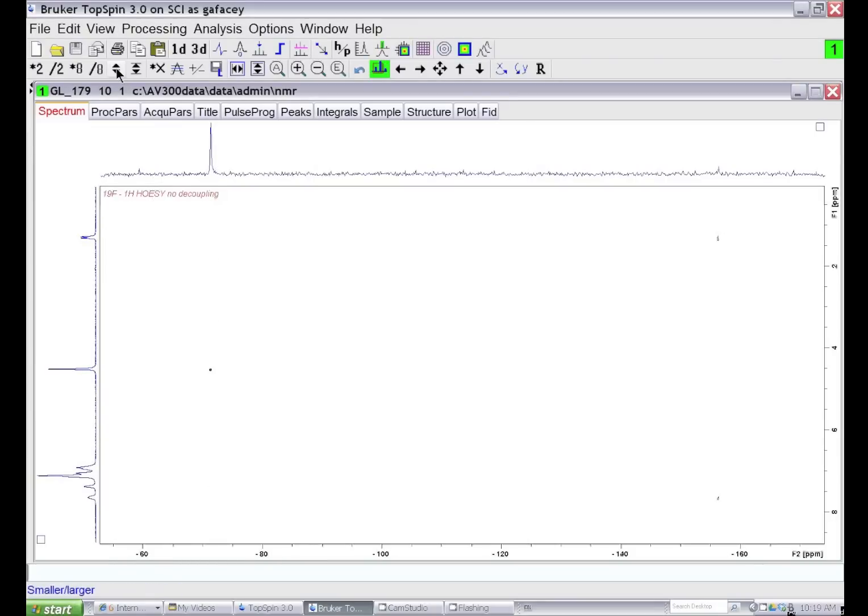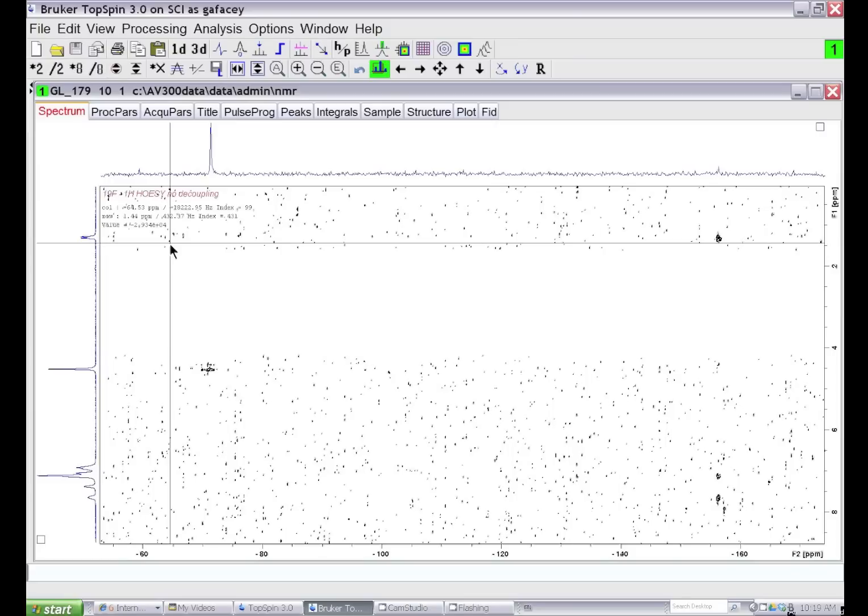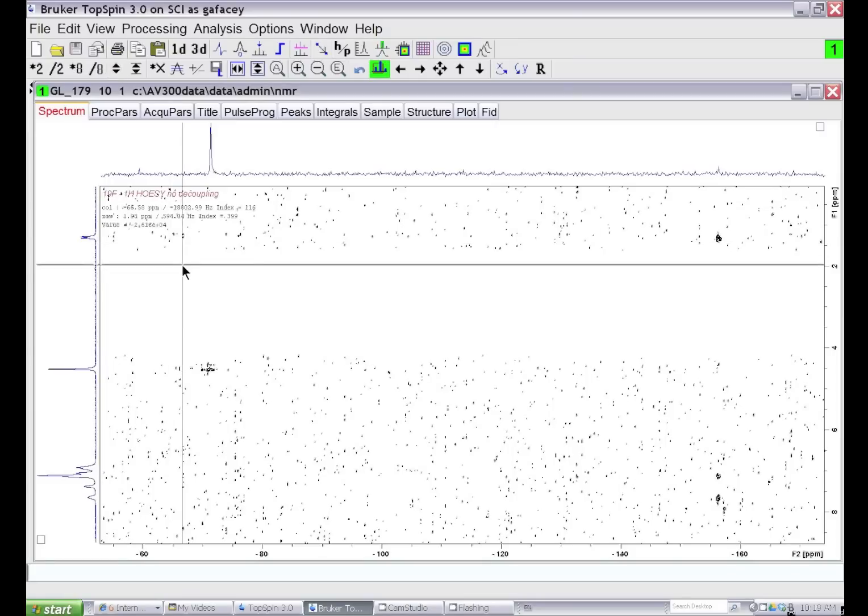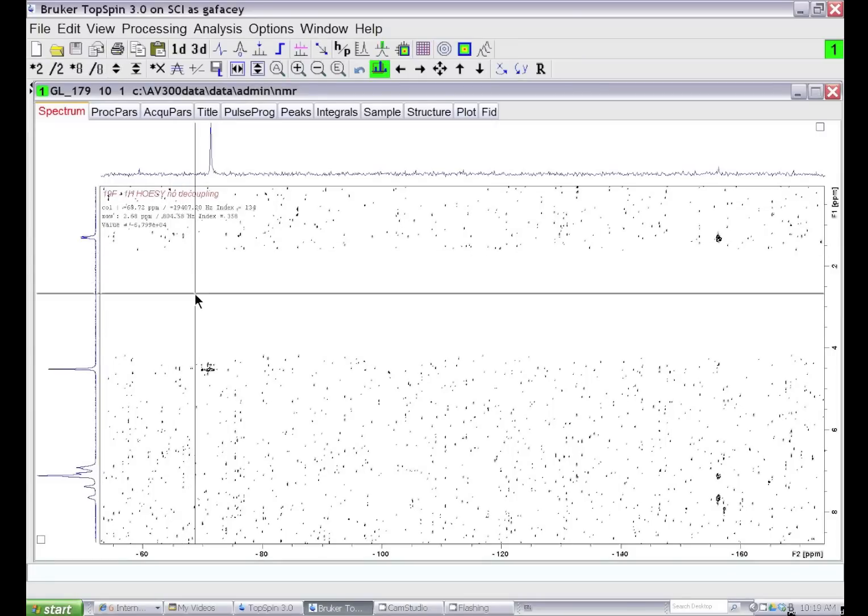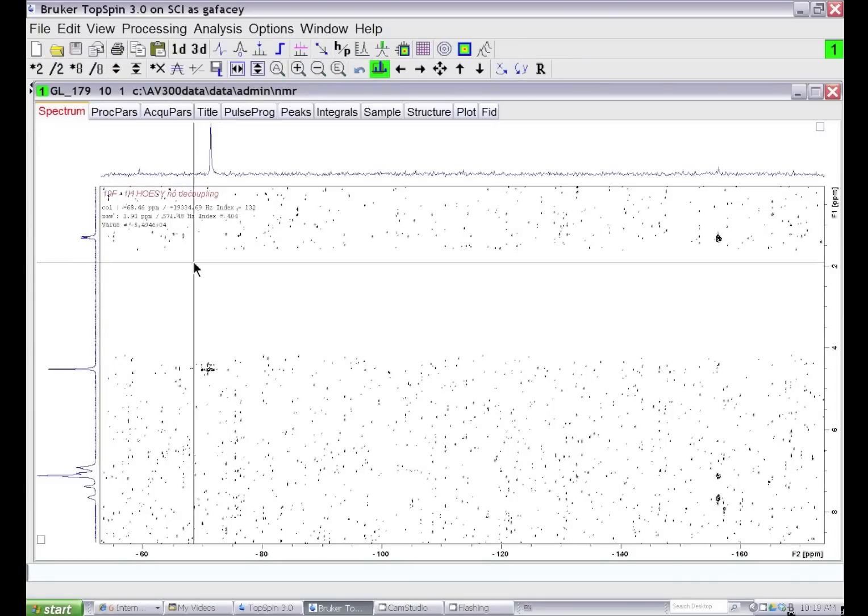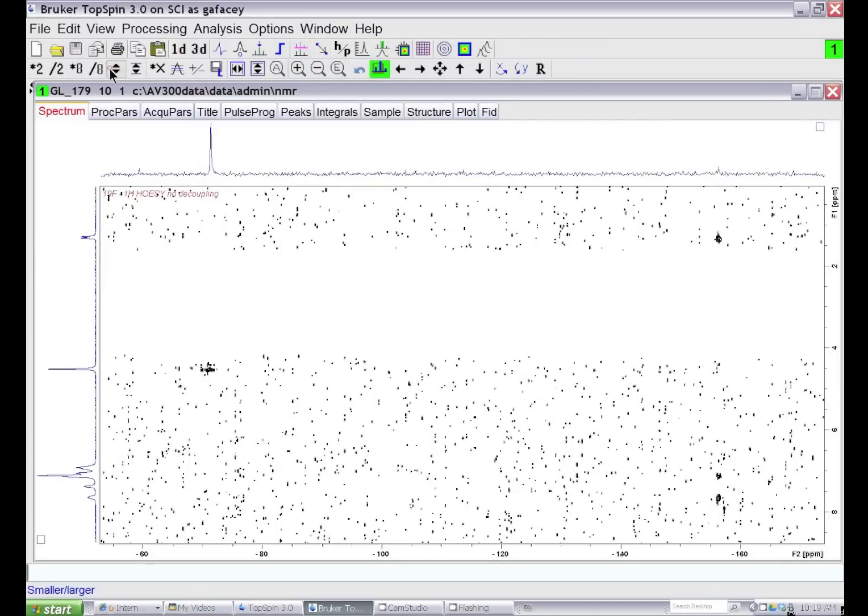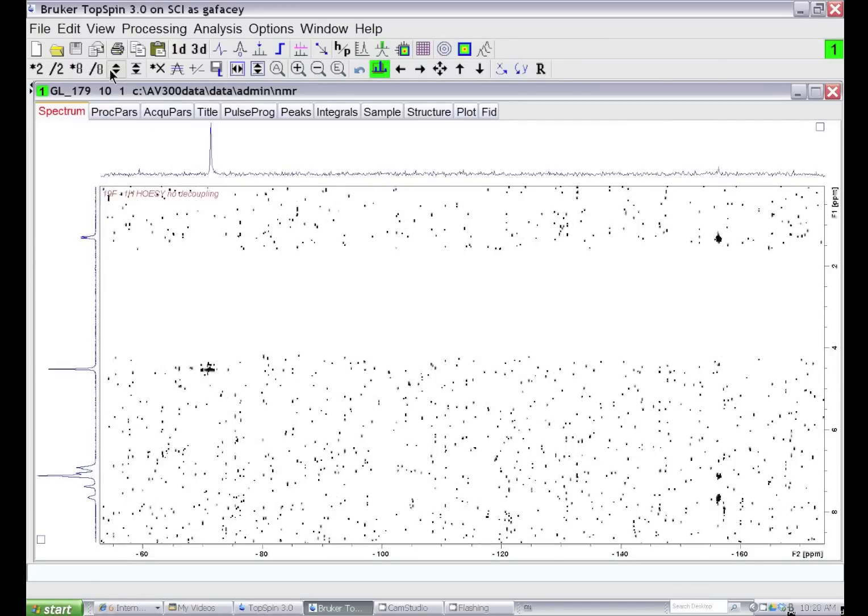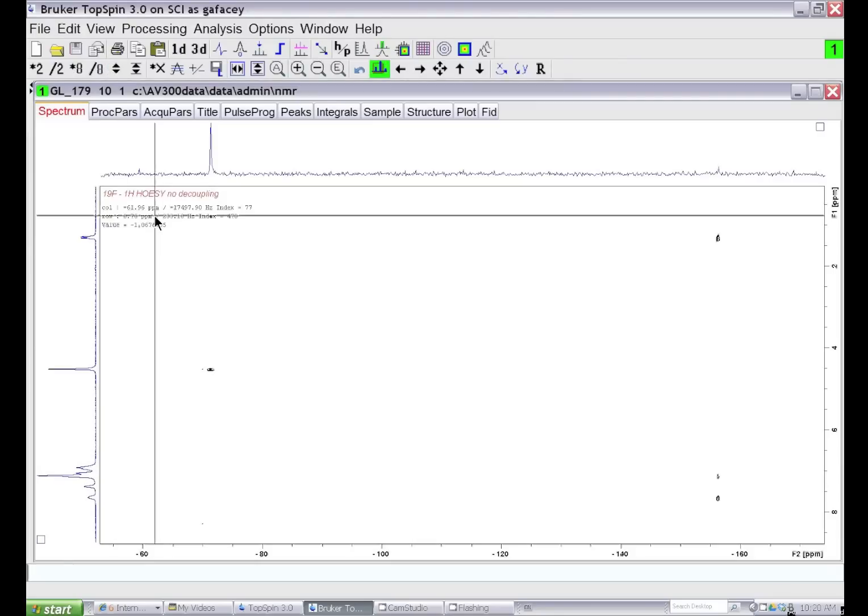Now you can see that the data is cleaned up. If I scale the spectrum up, you can see this region is void of any noise at all. That's why it's important that there are no signals here, or you would subtract those off as well. Scaling the spectrum at a more appropriate level, we have quite a clean fluorine-19 proton HOESY spectrum.